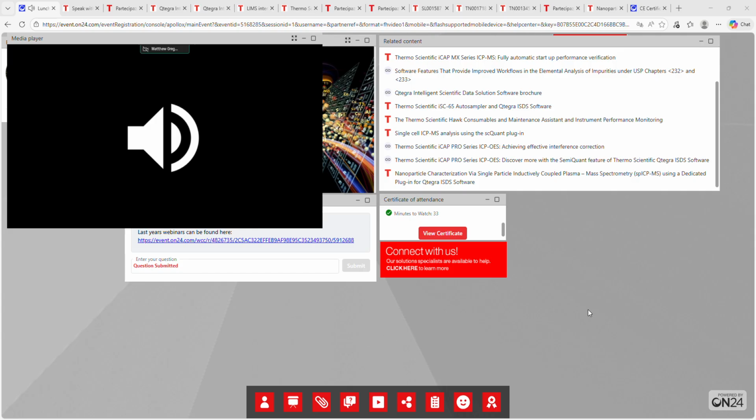And again, like I answered with the other questions, if we couple that with fast uptake and rinse, maybe a step ahead, if we have access to it, then we should be able to get you down to less than 3 minutes, no problem.